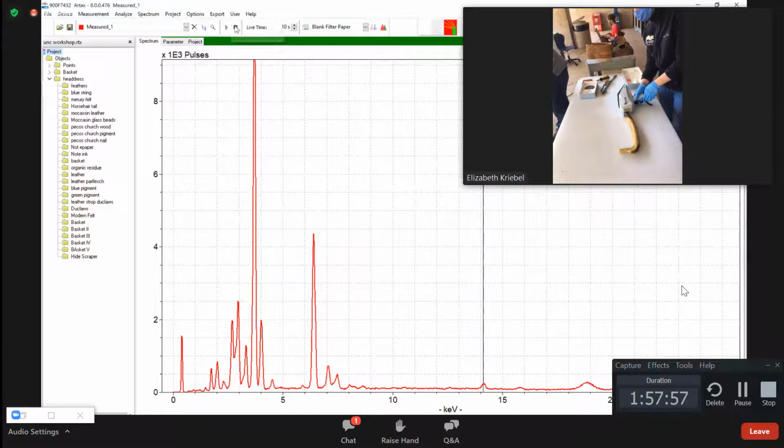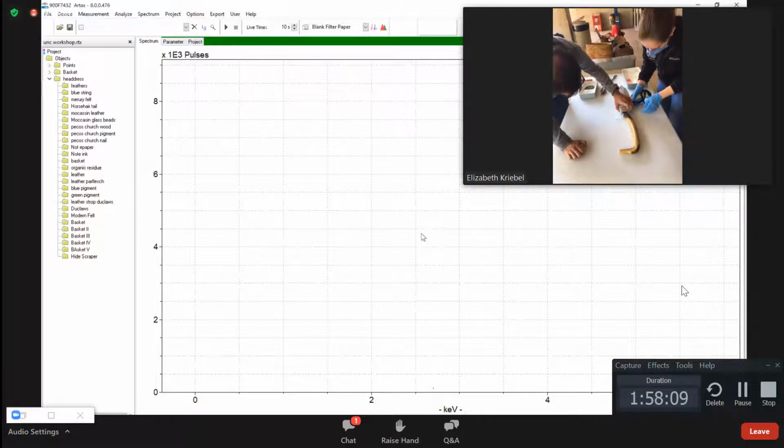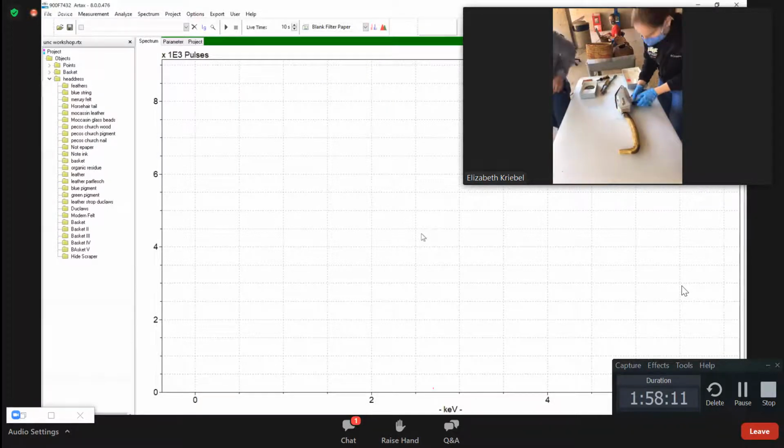We're not on the nail. Okay, yeah, here, let me. You can double check. Yeah, I was just getting the bone there. So you want to, no, so we're measuring in the oval right here, right there. Got it? Yep. All right, starting.